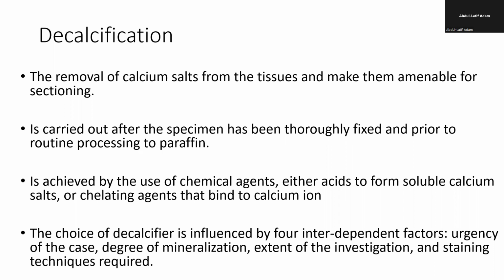So usually, the type of decalcification agent that you use depends on the density of the calcium in the tissue. Okay, how calcified it is, how hard the calcification is. That is what will determine the type of chemical or decalcifier that you use for the decalcification.